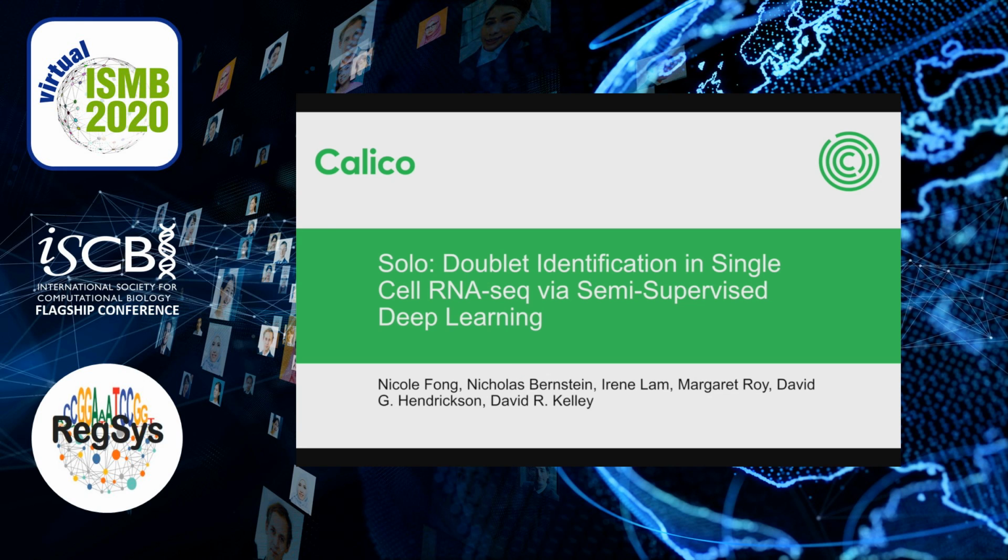I'm here to talk to you today about a tool for doublet identification in single-cell RNA-seq via semi-supervised deep learning. The tool is called Solo, and it was developed by me and my colleagues at Calico Labs.